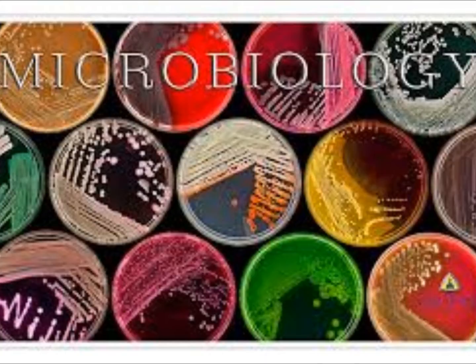I guess it'll do. I don't think it's bad if we don't get them gram stained, because we already talked about it in lecture. We'll see how far we get along, because they really need to start evaluating all that. Okay, so once you have your slide finished, just set it aside, and we're going to let it air dry. And we might stain it today, we might stain it tomorrow, we'll see. Mine's dry.